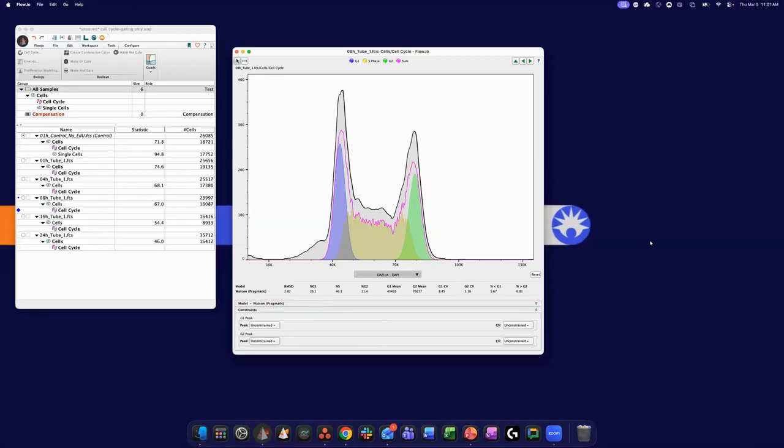Okay, and now you can include controls for things like that. So you could use your U2OS cell line and try to include different pharmacology agents to arrest different phases, and that gives you a little bit more leverage for arguing why your data looks different.